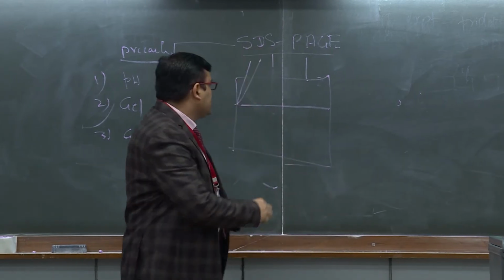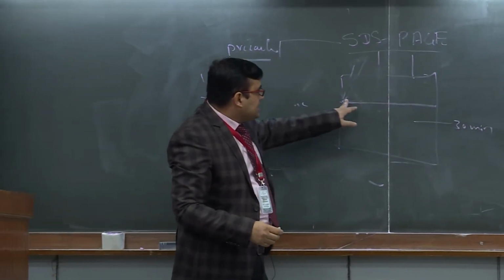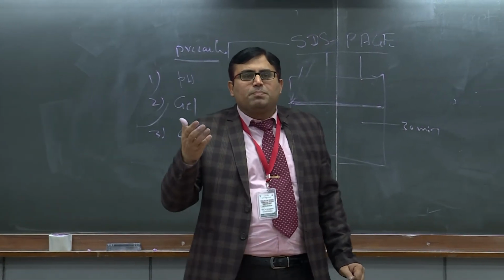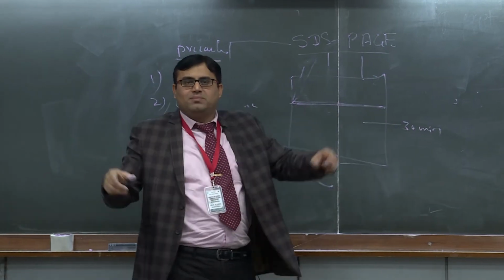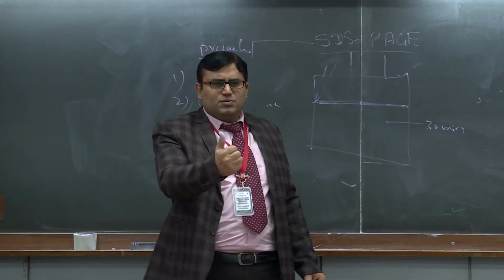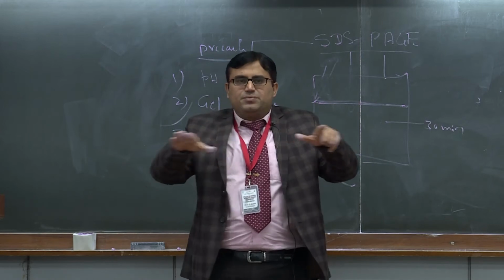right? Third thing is, once you have poured this and kept it for polymerization for approximately 30 minutes, then this particular washing, this transition, should be uniform. So people add isopropanol, a few people add water itself. Even if you add water, that will keep it uniform. If it is not uniform, 100% you will not get the results, right? So you can add water, you can add any organic solvent. With an organic solvent, you will make a uniform layer, and once it polymerizes, the layer will be uniform.